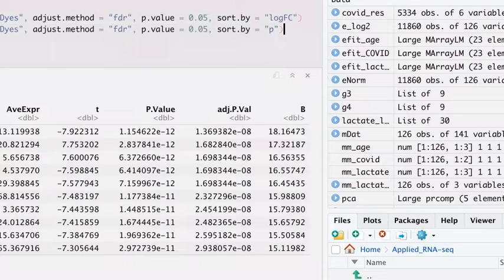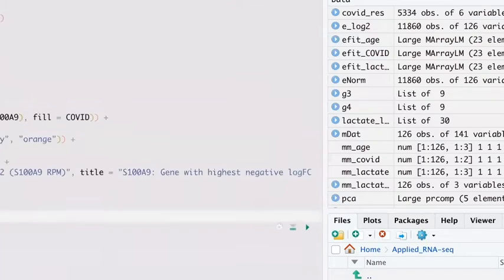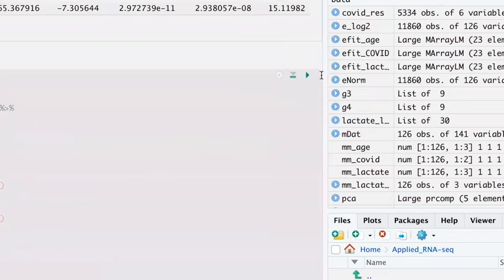But then again, when we are talking about biological data, once you have everything that is significant, a log fold change value actually shows you how much of a difference there is between the genes that we see, right? So that is the metric that I use more, once I have everything subset by the p-value that I want. Okay, so this, I think you can just probably run.